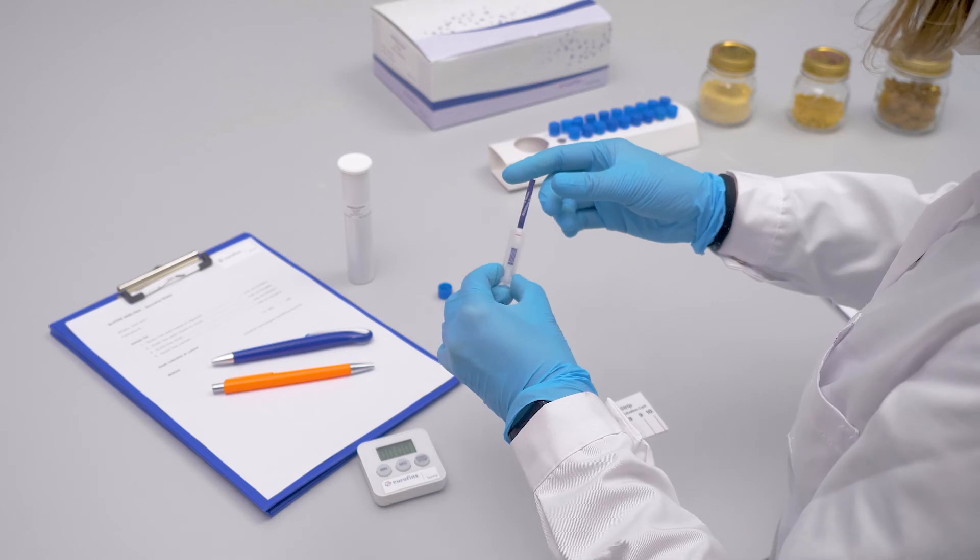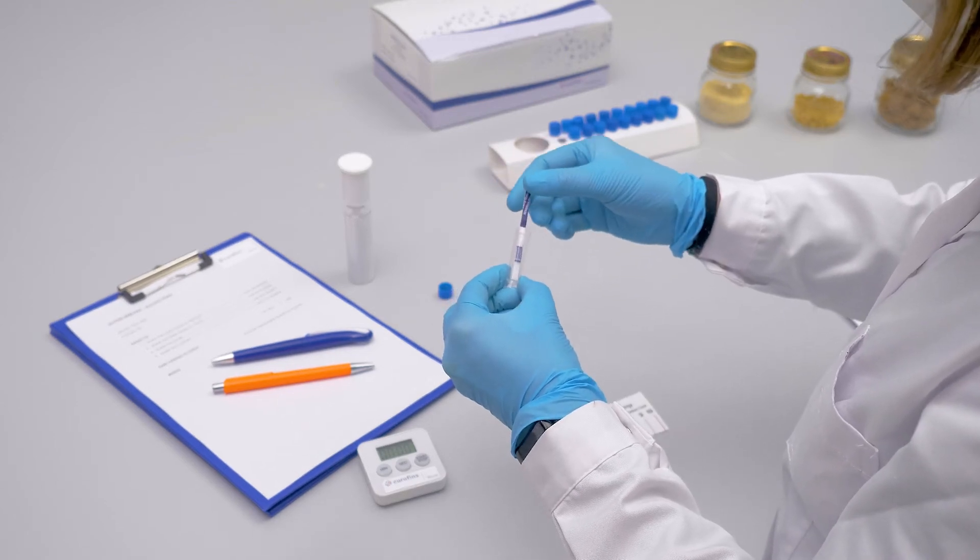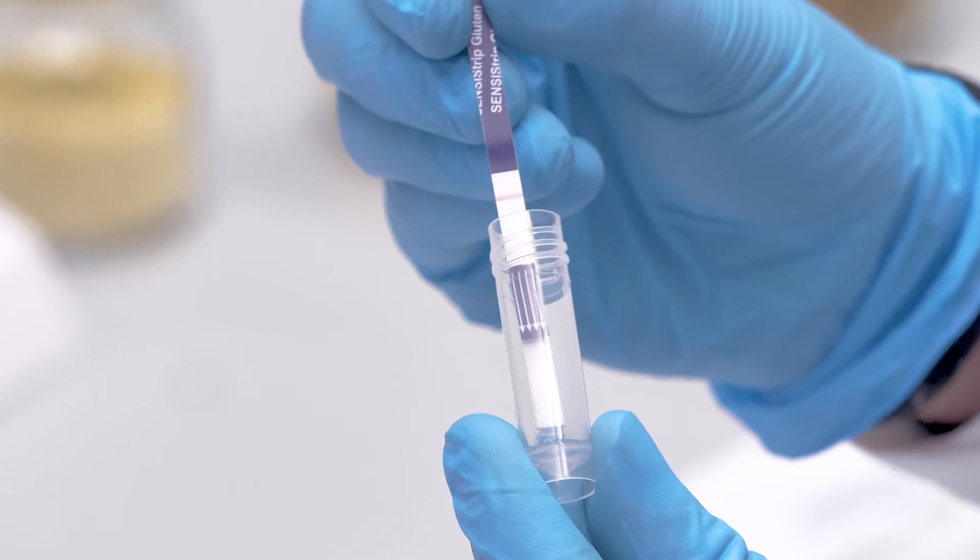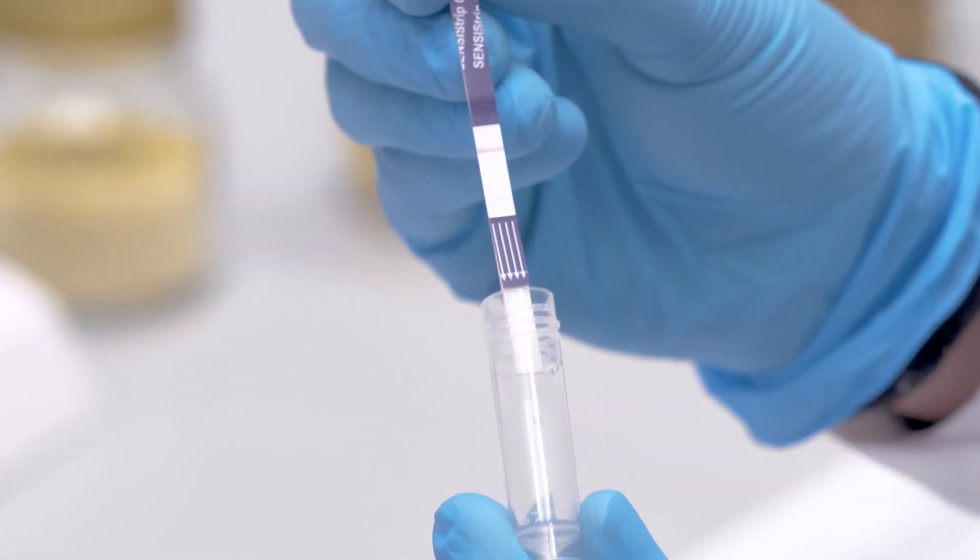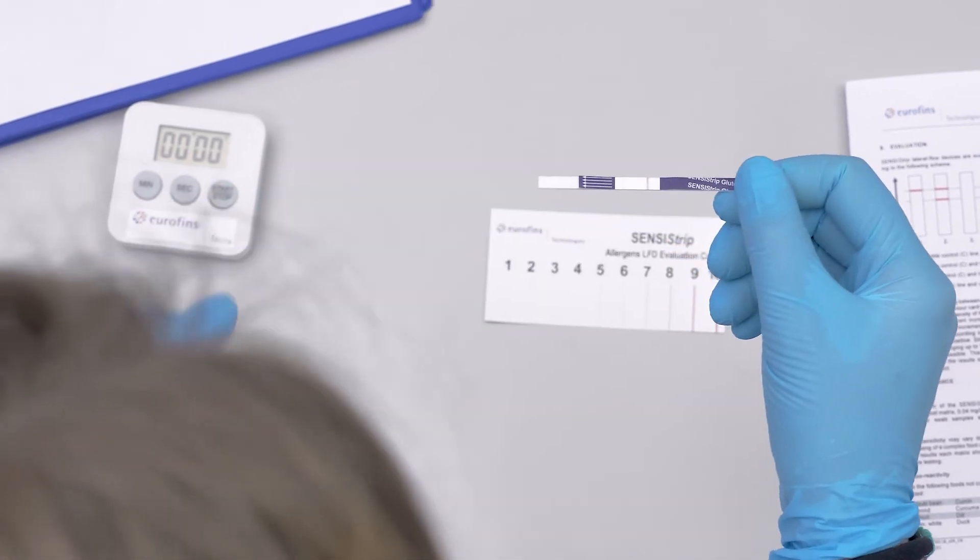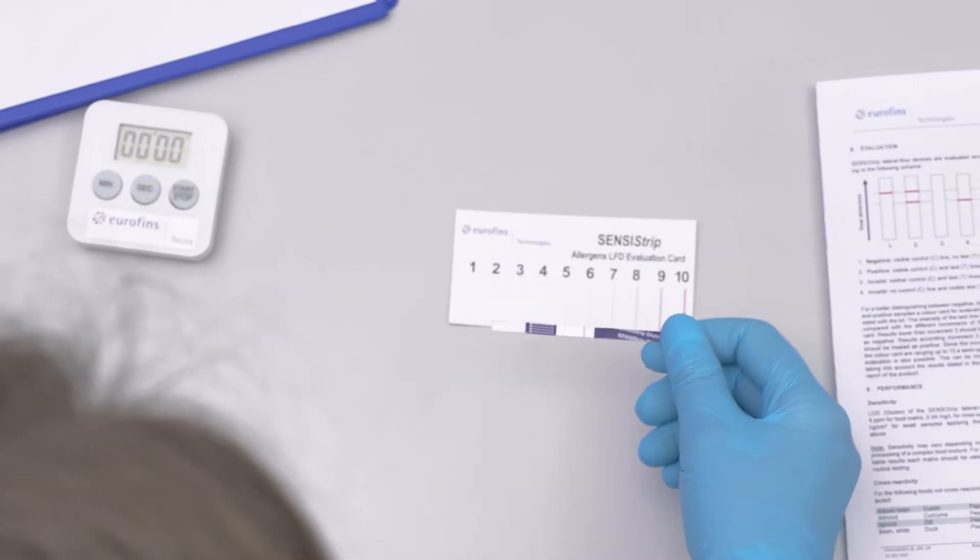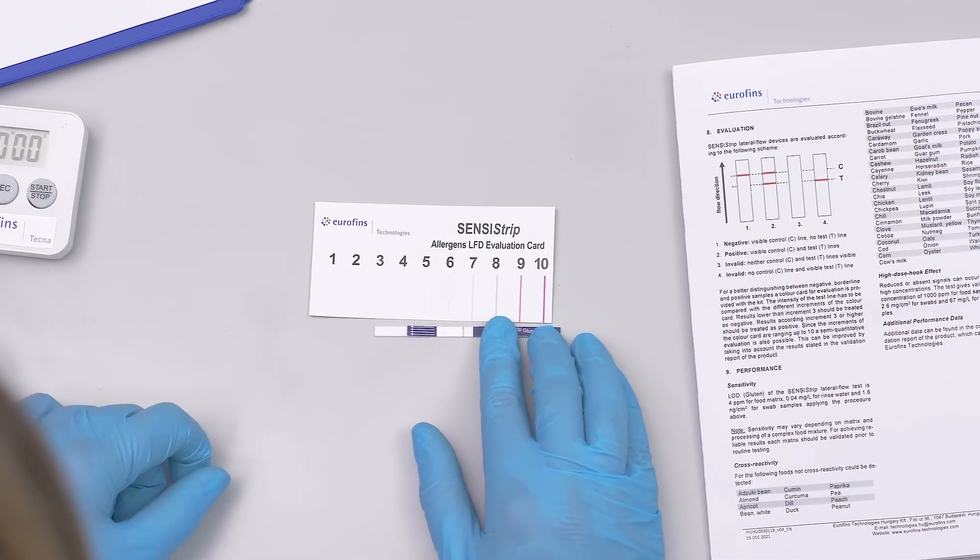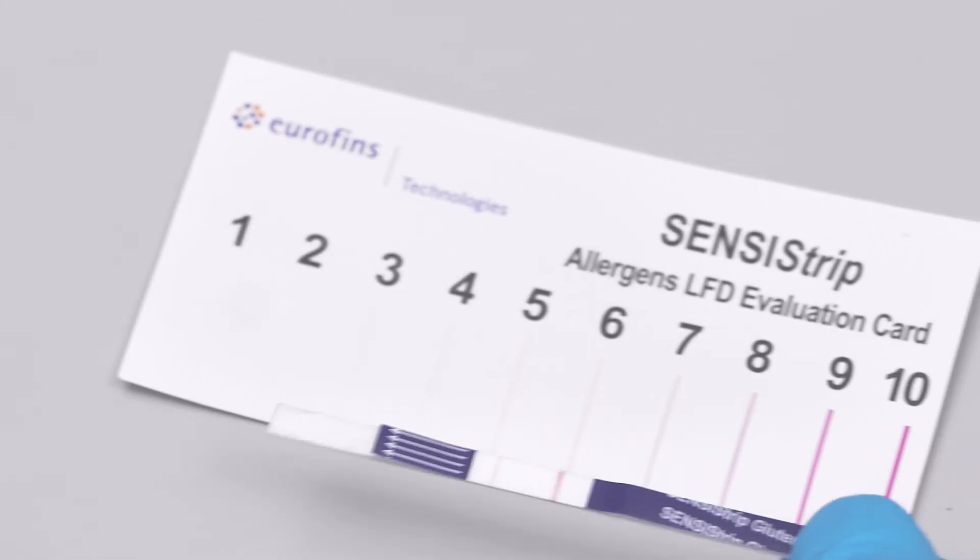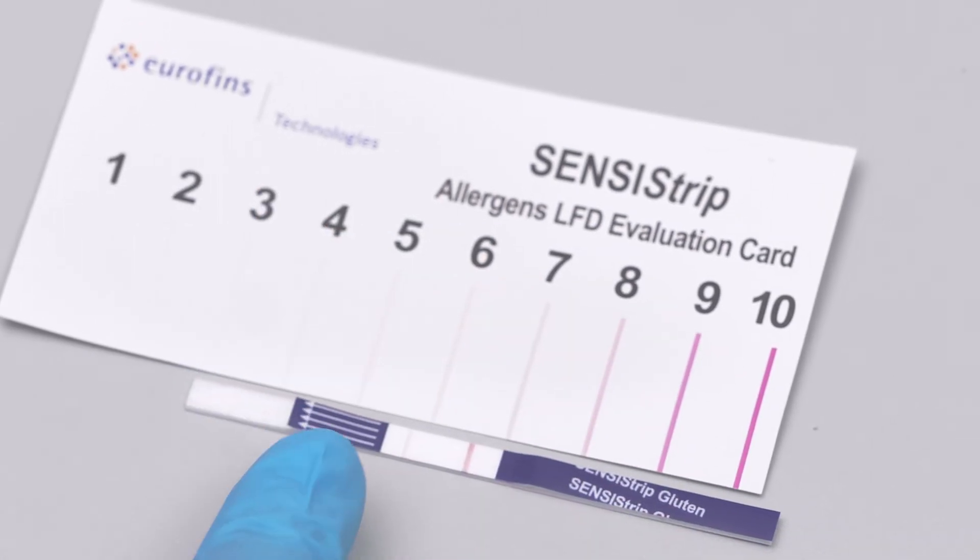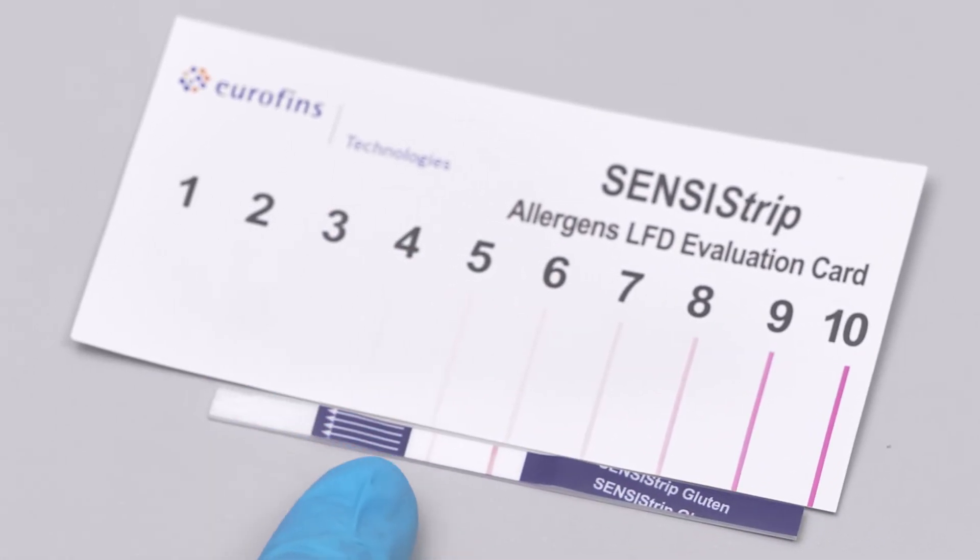Extract the strip and verify the validity of the test. The test is reliable only if the control line marked with a C is developed and visible. Only then it is possible to evaluate the result of the test using the evaluation card contained in the kit. The sample is considered negative if the test line is absent or has intensity one or two, while it is positive if the band is more intense.